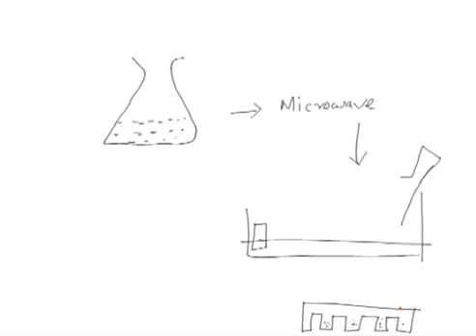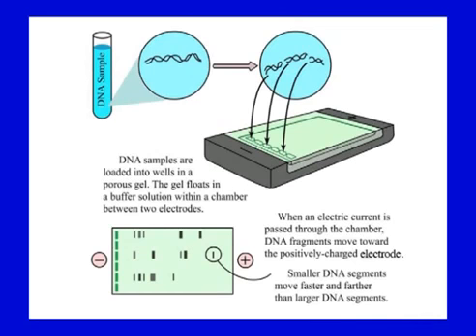Now, once you have done this, your gel is ready after, say, 1 hour, and it is ready to be used. All right. So, let us go back to our discussion. Here, if you can see in this figure, like I was showing, the gel is cast here, and these are the wells, which are a few in number here.